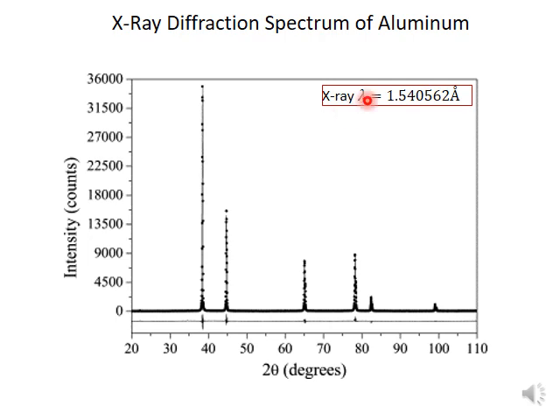One important piece of information you need to know is what X-ray wavelength you use for this experiment. Normally you can find that out from the setup of the X-ray source which is creating this incident X-ray. The more precisely you know the value of this X-ray wavelength, the better. So this is something you start with.